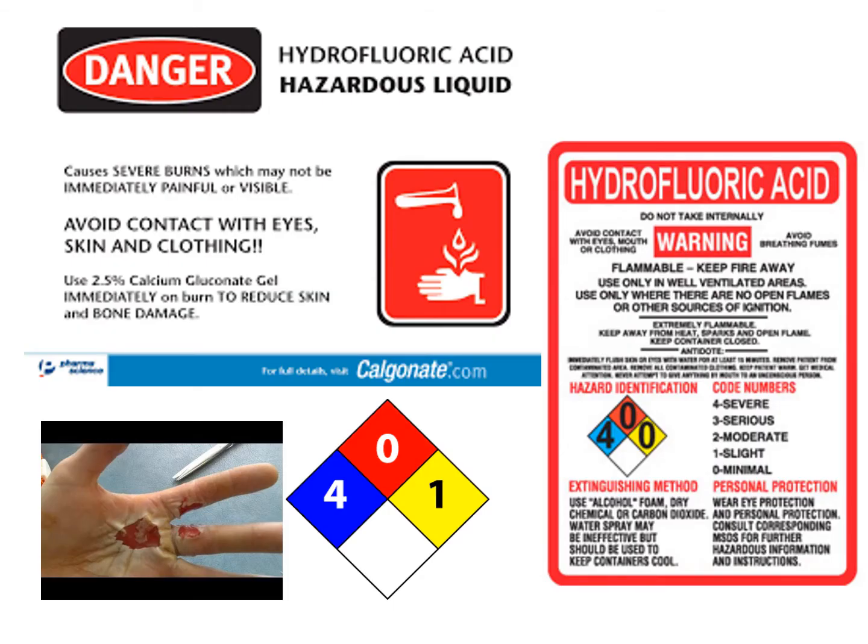So this is hydrofluoric acid. I don't know whether you have heard about this hydrofluoric acid. It's a very corrosive material. If one drop of hydrofluoric acid touches your hand, you could die within 5 to 10 minutes. It's very reactive, and it will react with the calcium in your bones, right? You can see some images shown here, and the number 4 is highly health hazardous. We can apply calcium gluconate as a gel in case of emergency.